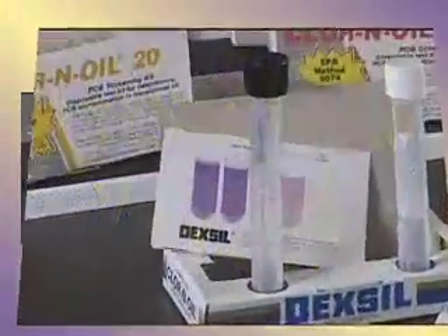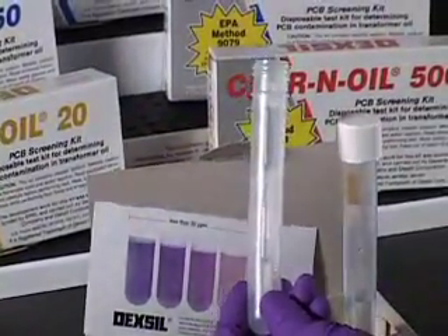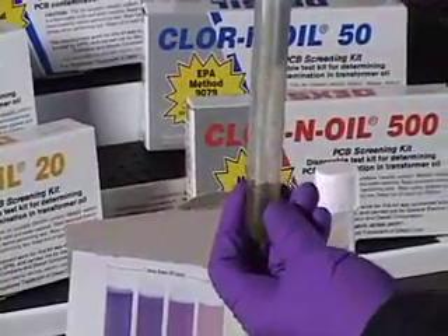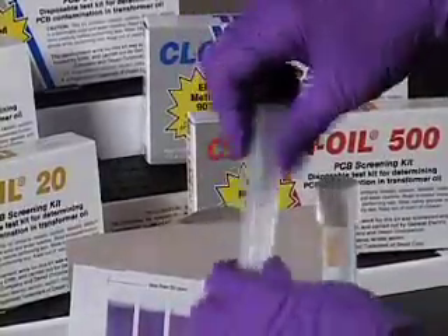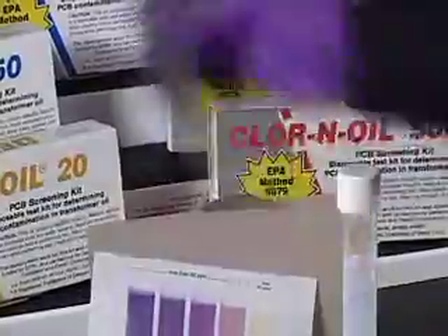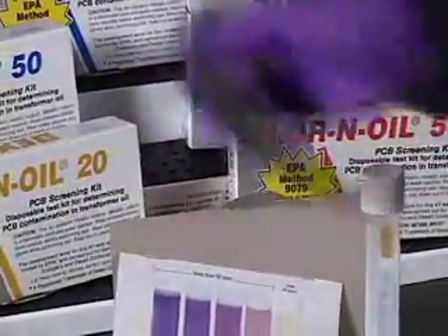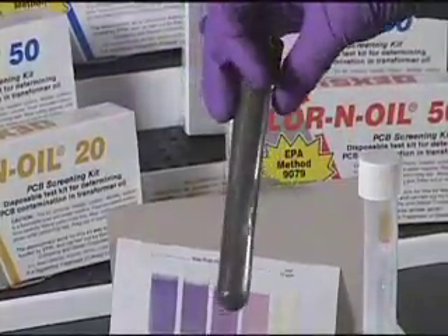Performing a valid test. Unscrew the cap from the black-capped test tube. Add the oil sample and replace the cap. Break the bottom ampoule and shake vigorously. Next, break the top ampoule and shake vigorously. Observe the dark black color coating the tube — this indicates a successful reaction between the sodium and oil. The test can proceed.